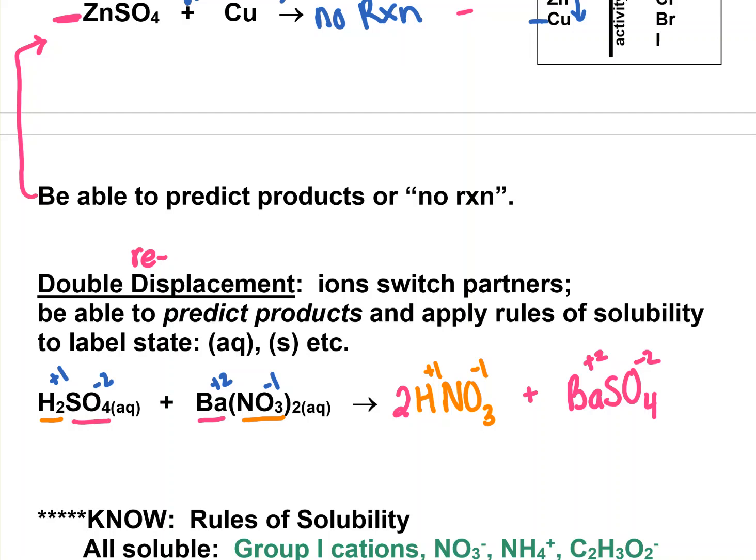Now this is a reaction that you do in the lab, and when you do this, you mix these 2 solutions, which are clear, and it does turn cloudy. And since it turns cloudy, you know that one of these is insoluble, or in other words, is a precipitate. And you have to know which one. Well, I can tell right away, HNO3 is a strong acid. It wouldn't be a precipitate, but also I see it contains nitrate, which doesn't form any precipitates. So this one must be our solid or precipitate, and this one is aqueous. It's a strong acid.